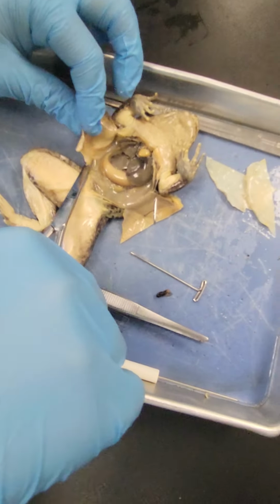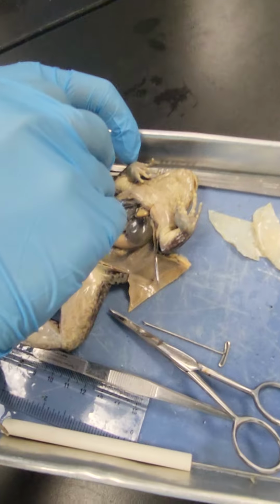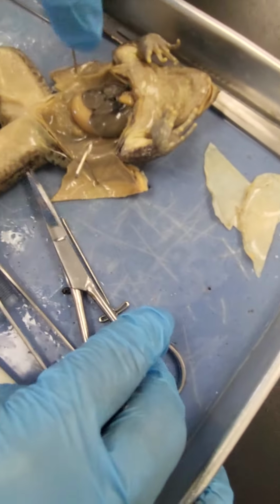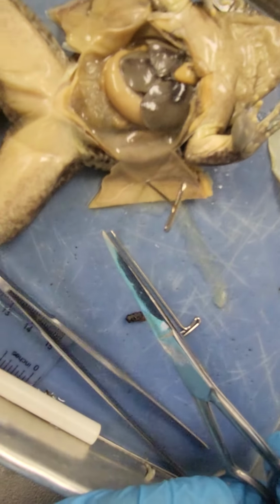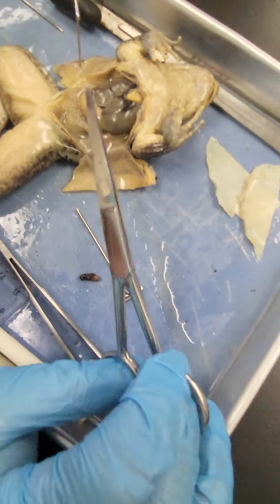That's one juicy frog. Oh my god, that's nasty. This would be perfect to cook. Okay, what else? No, we need to go for the fat bodies. Guys, he already comes with gravy.